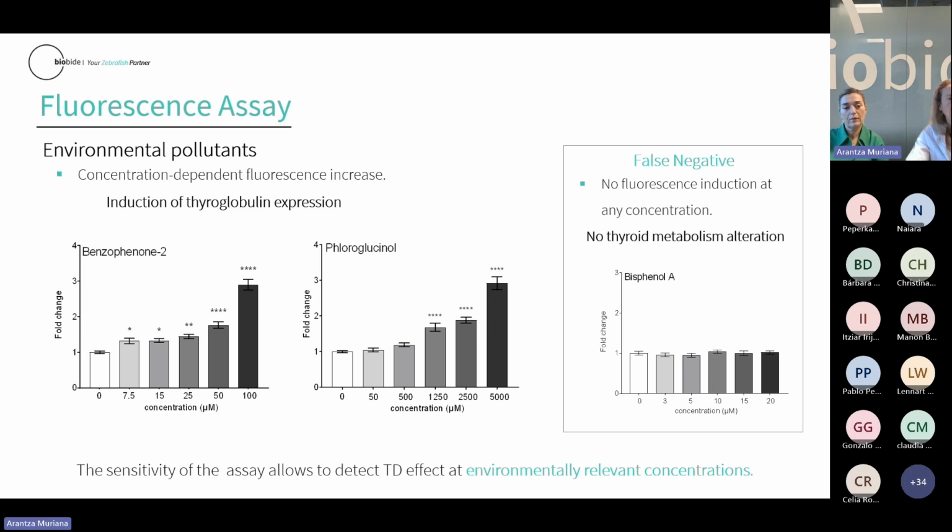But as a summary of this assay, we can say that the sensitivity of the fluorescent assay allows us to detect the thyroid disruptor effect at environmentally relevant concentrations for almost all the compounds.